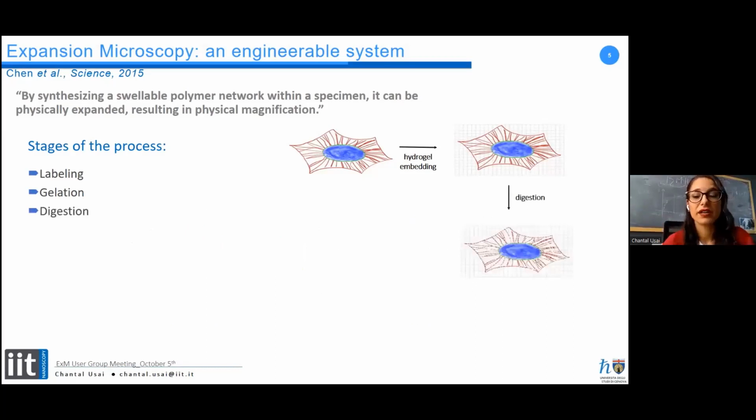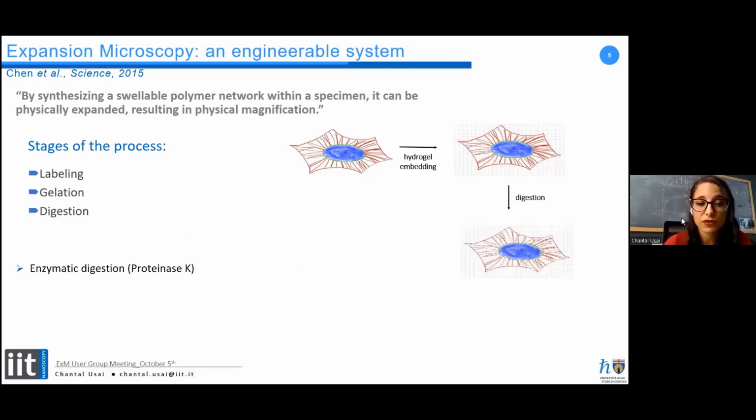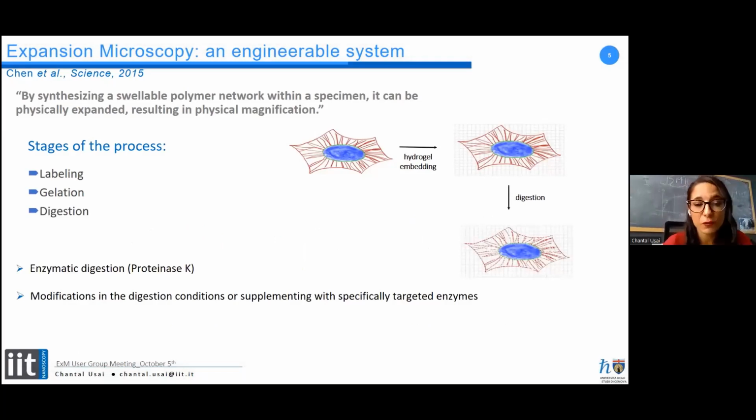Then we have the digestion step that originally started as an enzymatic digestion using a proteinase, but then in different protocols during this development, we discovered that by modifying this digestion buffer, you can target it to your specific biological sample. And for example, you can supplement it with specific enzymes to digest your sample.